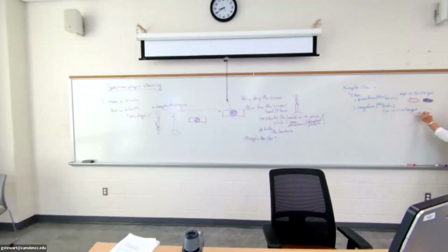What that's going to do is, because the dye is negatively charged, there's going to be a tiny little space between where the dye is sitting and the bacteria. I'm exaggerating it on the board. It's obviously a microscopic space, because when you looked at the negative staining slides that I had on the side of the room, we say the background is stained and the cell is clear. Again, that would also look better on the bacillus than the staph that we had.